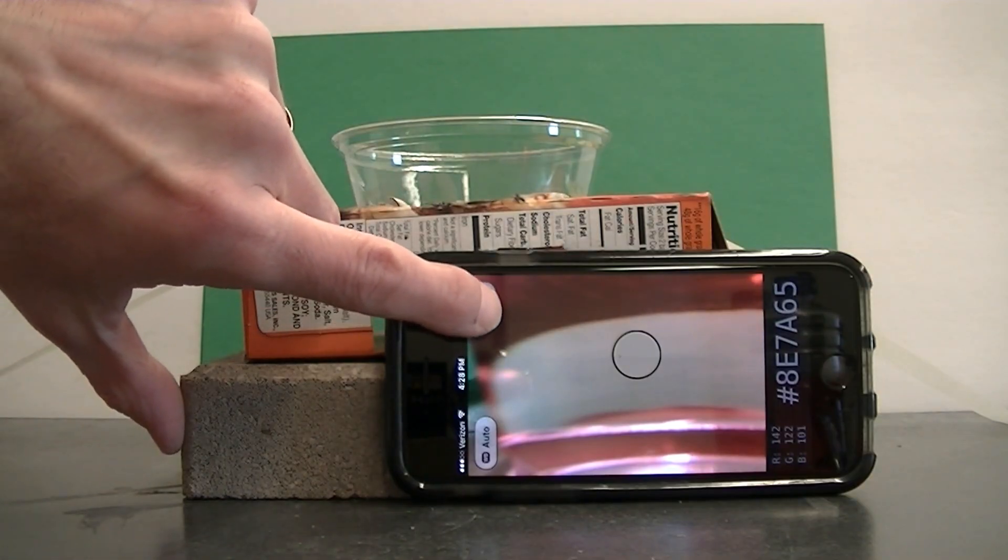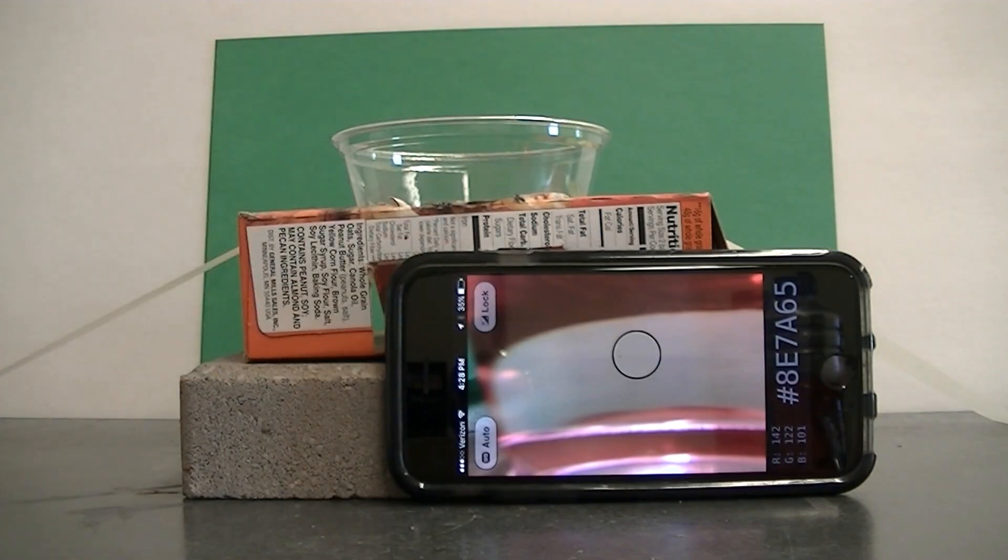I'm also going to press this button here that says auto so that it reads lock. I don't know what that does but I know it gives me better results so I'm going to make sure to do that.